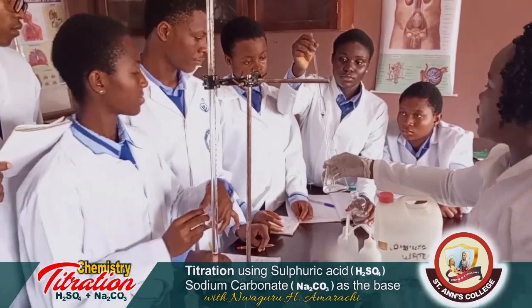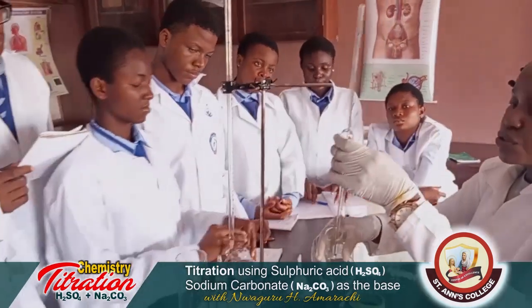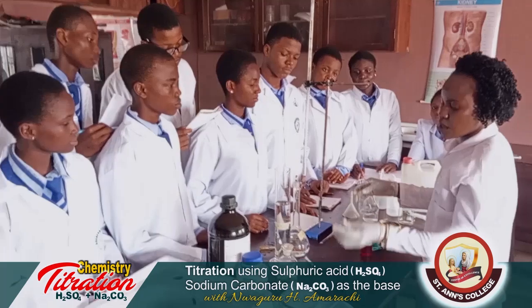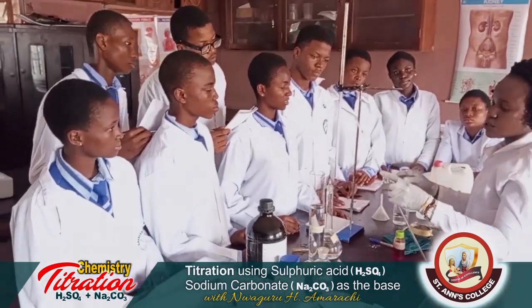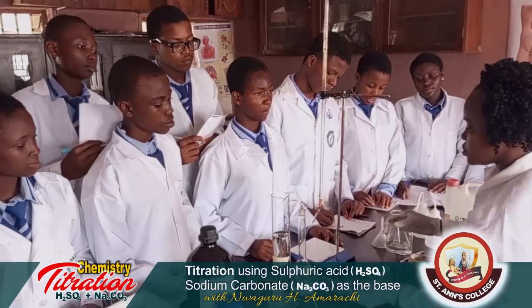In titration, we have a standard measurement of the base we are going to use to titrate a particular volume of the acid, which is the 25 cm cubed of what? Good.